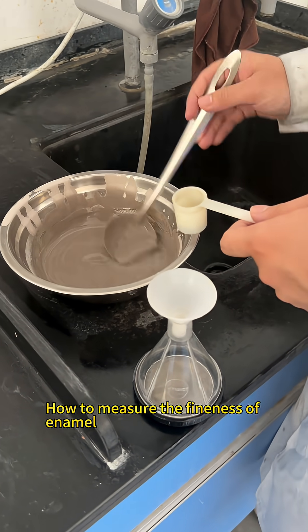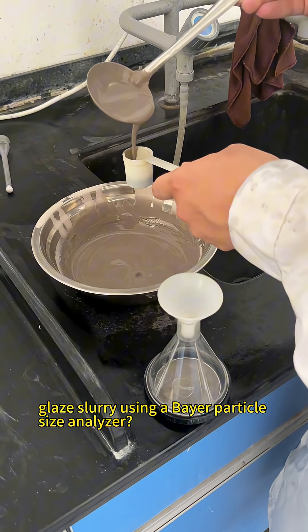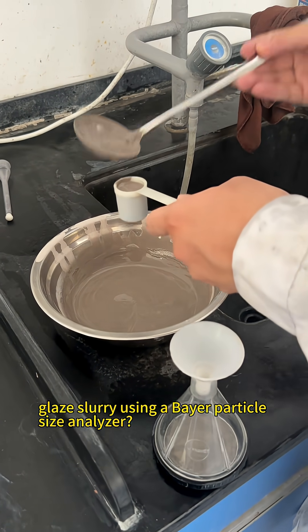How to measure the fineness of enamel glazed slurry using a Bayer particle size analyzer.